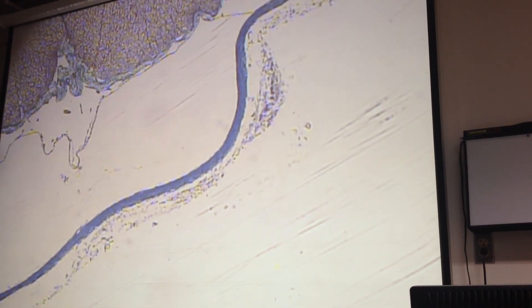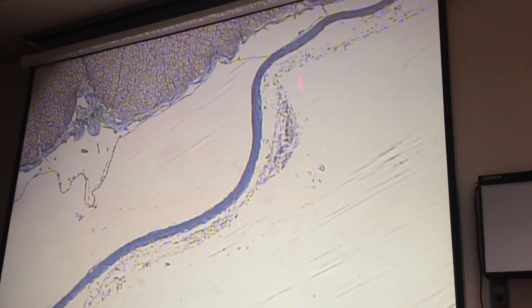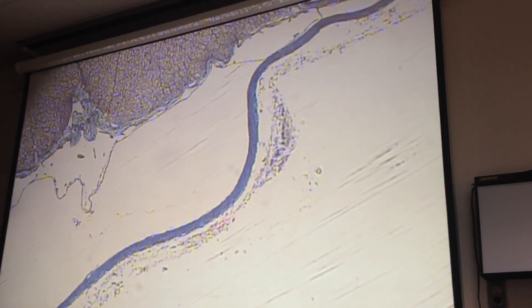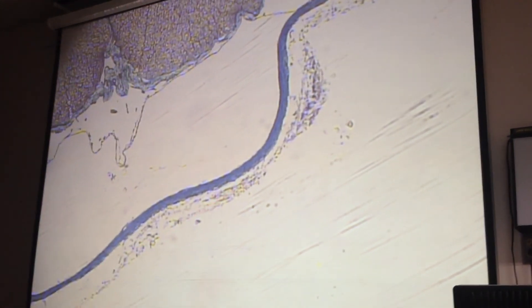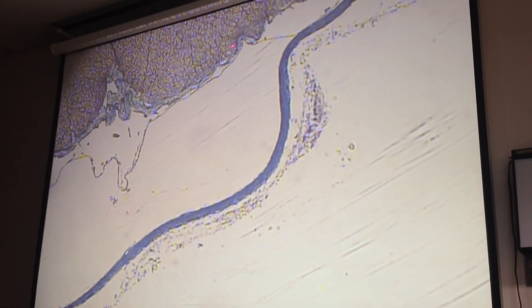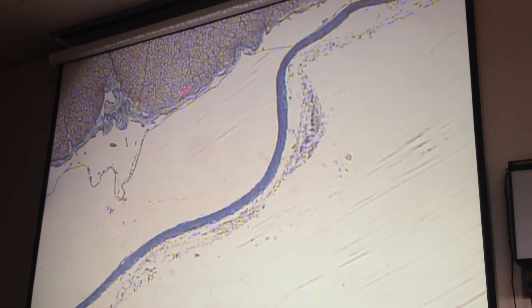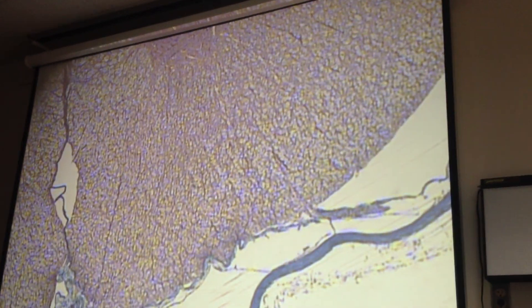Out here, somebody called this, what did somebody call that? The floating layer. This is what? Dura mater. Yeah, that's the dura mater. The arachnoid mater kind of fell apart. The pia mater is this one that's right on top of the spinal cord. I know on your list it just said spinal meninges, but I wanted to at least show you the dura mater.